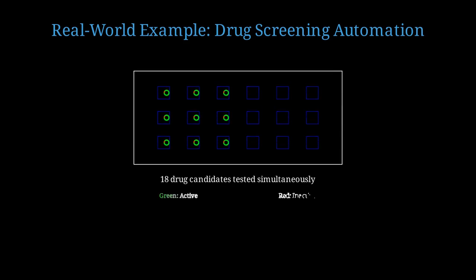Consider high-throughput drug screening using microfluidic devices. In drug screening, we might test hundreds of compounds against various cell types. A microfluidic chip can test dozens of drugs simultaneously in separate channels. But determining optimal drug concentrations, incubation times, and cell densities is complex.